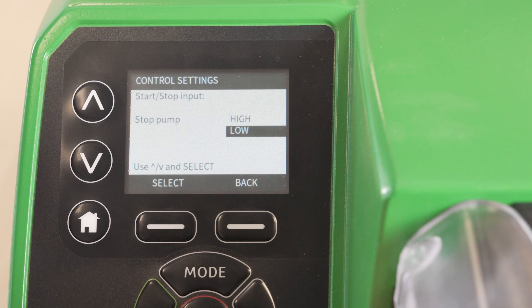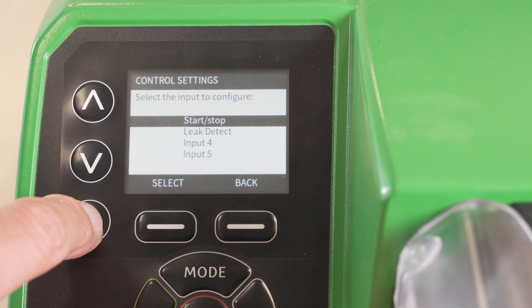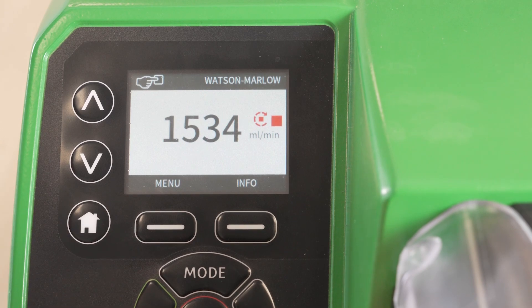Refer to the instructions for more information. Select the home screen to exit the menu. You should now see a red square icon on the display which indicates a stop input condition.